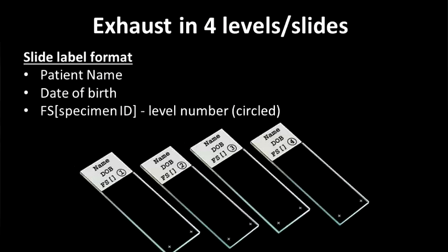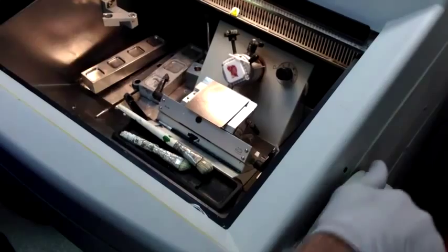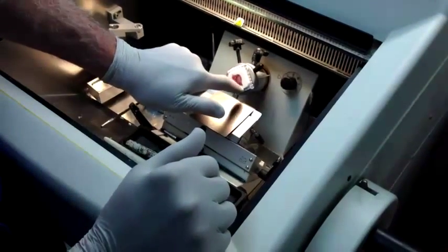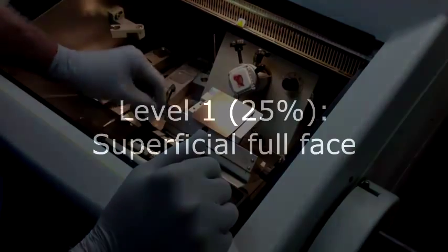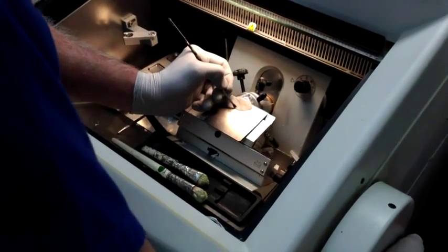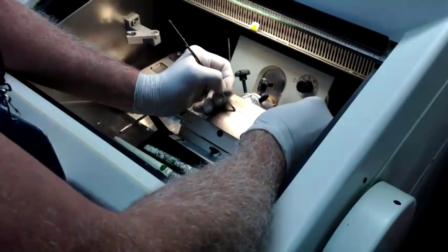So I'm going to exhaust this in four sections. We have already faced the block, and our first section will be a full face like this — we're seeing all of the tissue all the way around. This is my first section, and all these sections will be labeled one through four, because we're going to exhaust in four.